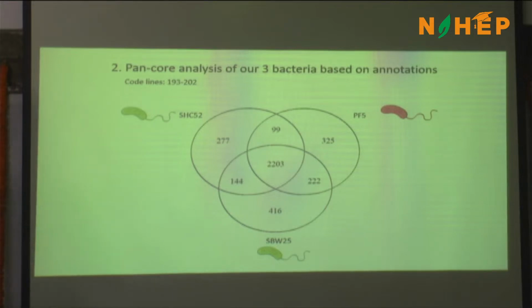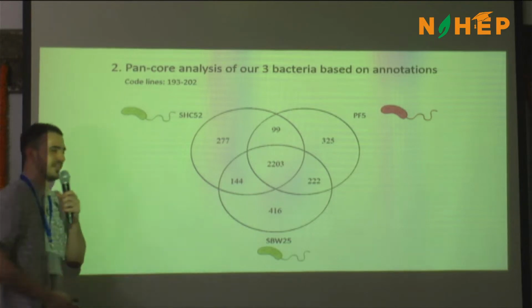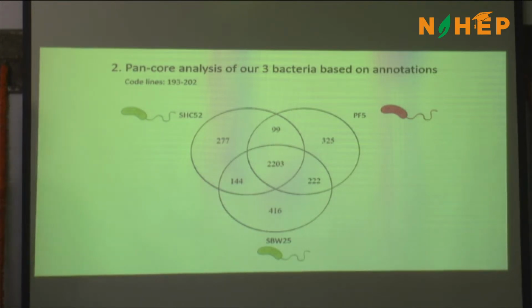Can someone tell me which annotations are common in all these 3 bacteria? How many? Good, the 2,000. 2,203. But now we are interested in our analysis, right?